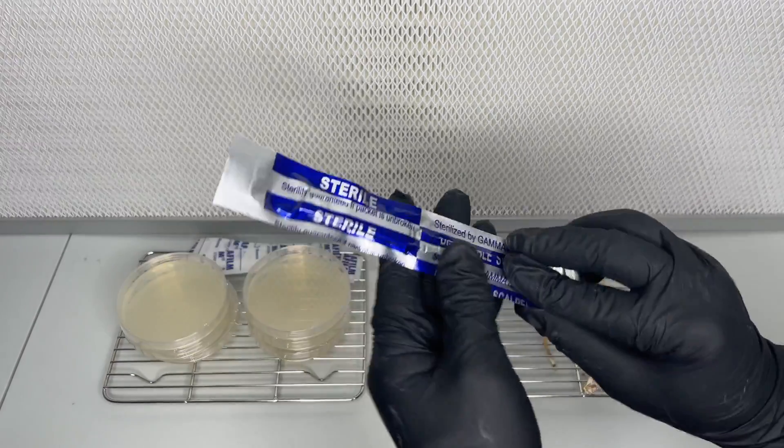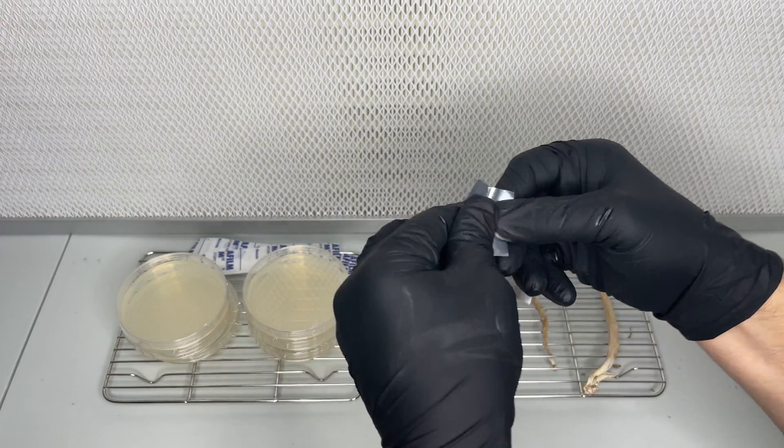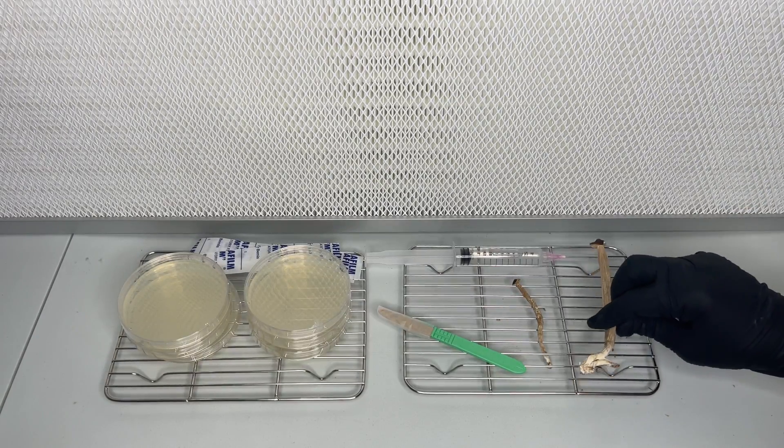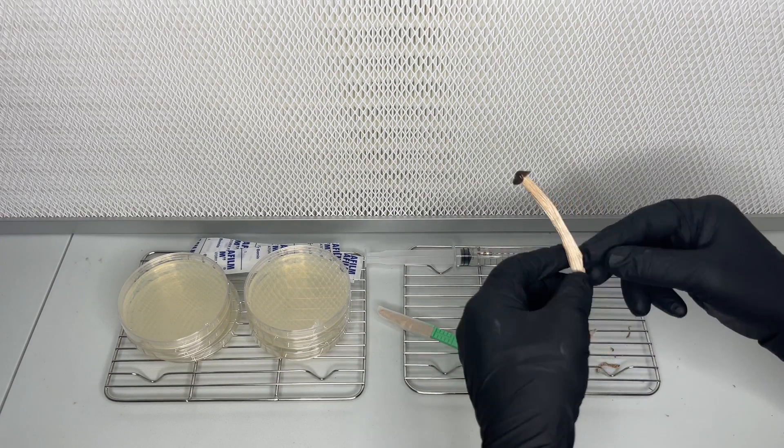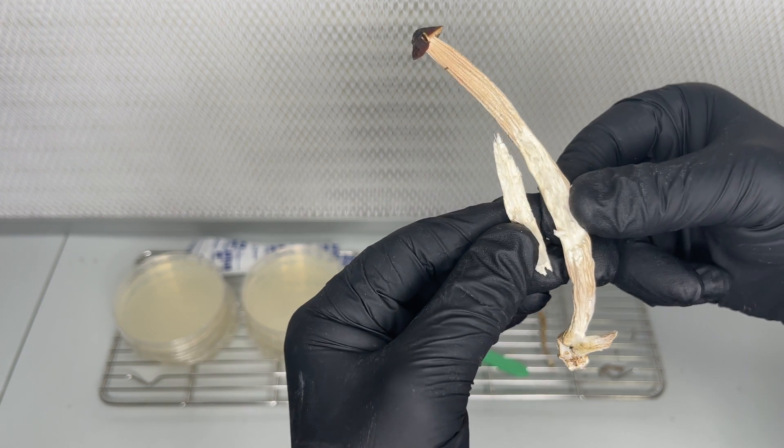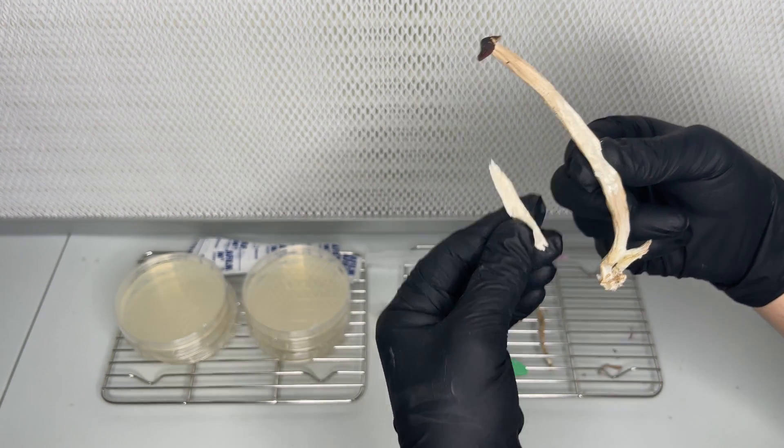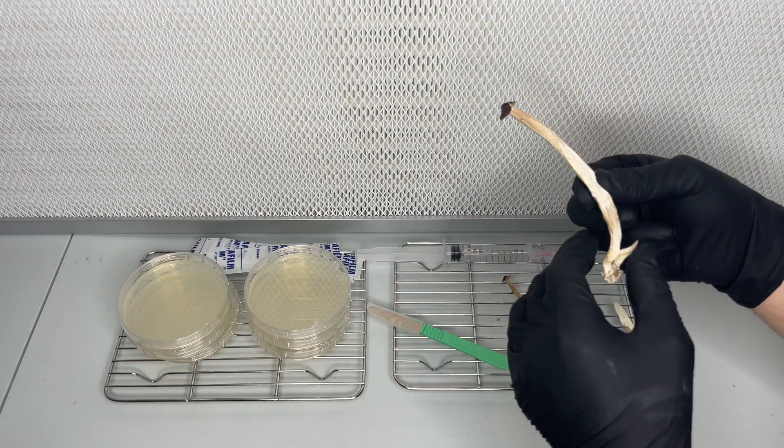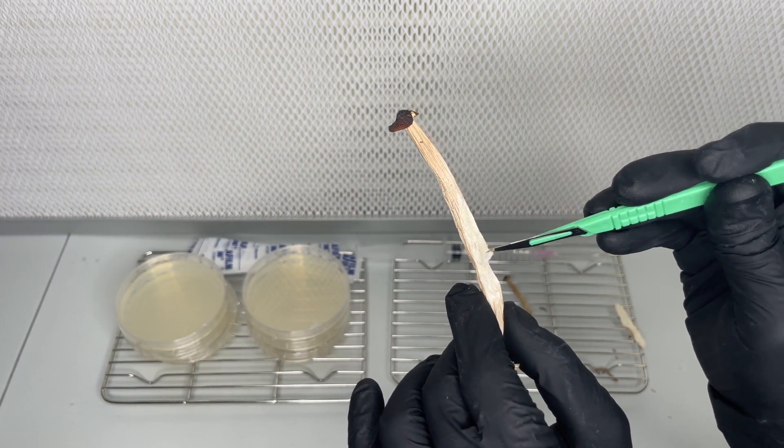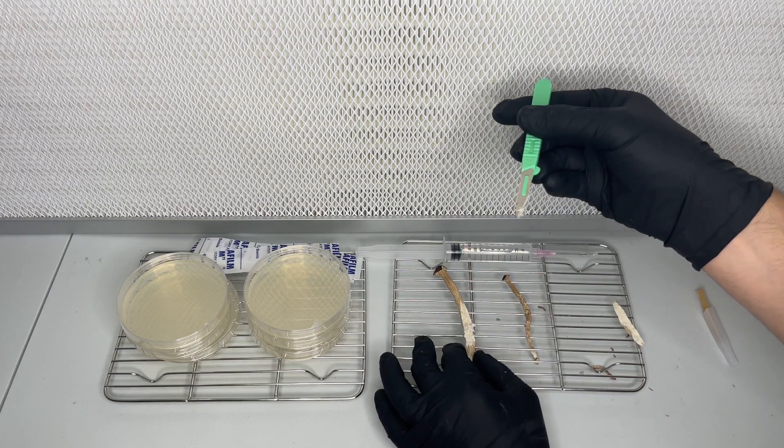I use a disposable sterile scalpel to transfer the tissue to the agar plates. The first mushroom is one that was dehydrated at 130 degrees Fahrenheit and I split it open exposing the tissue on the inside and used the sterile scalpel to transfer a piece of the dried tissue to the agar plates.